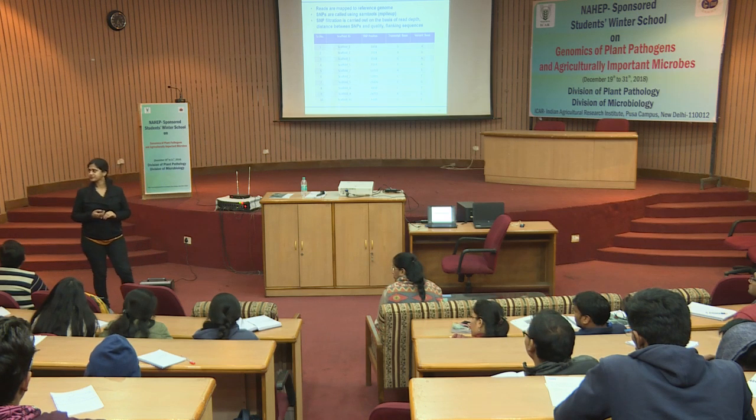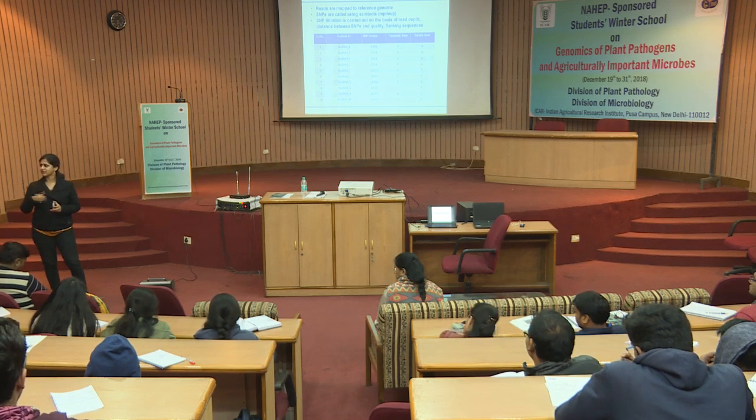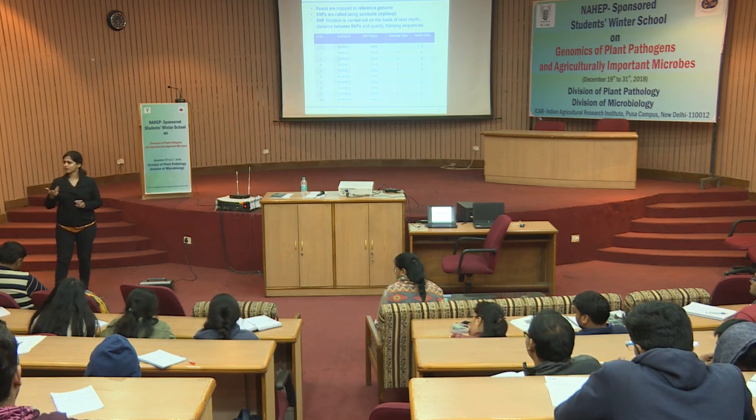So, SNP calling is based on consensus only. Based on consensus, it is usually picked from the BAM file. Consensus is also picked off from the BAM file.